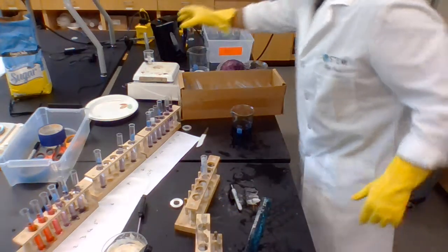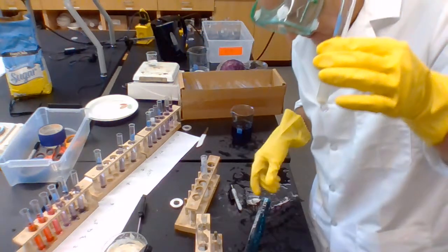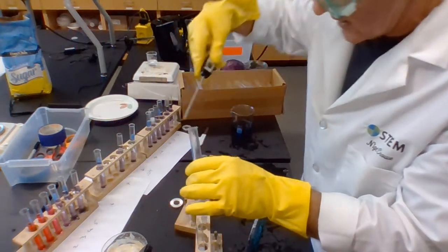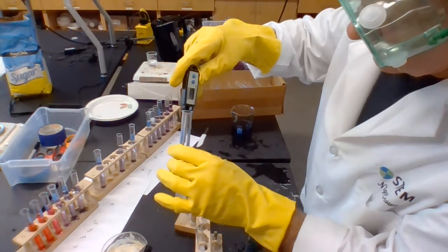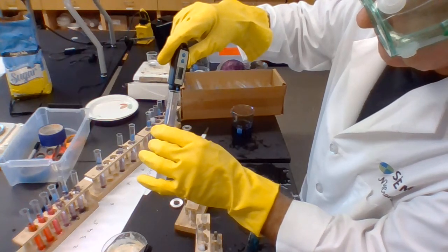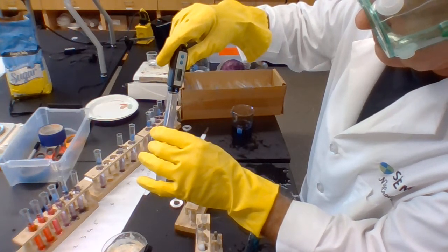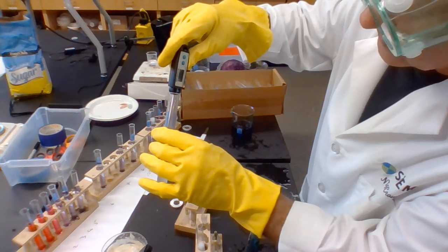Now let's have a look at this one that's bubbling away on here. It's been on the hot plate. I've been heating up the stuff inside it. Let's have a look at this one. 61, 82, 86, 87, 88.4. And it should top out at about 90 degrees.